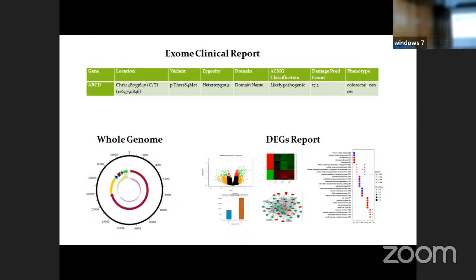If you ask me to tell you the top genes, or the top pathways, then I will tell you based on statistics only, right? If I tell you the top 10 genes, you may not explore all 100 pathways, right? Then you will lose your data. That is quite important. So this is the image you are seeing, of pathway analysis.